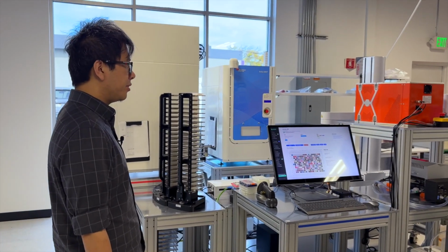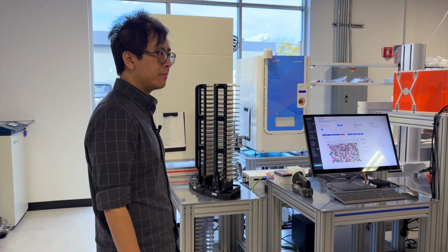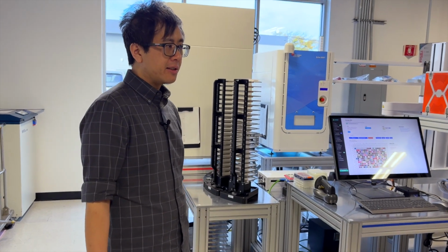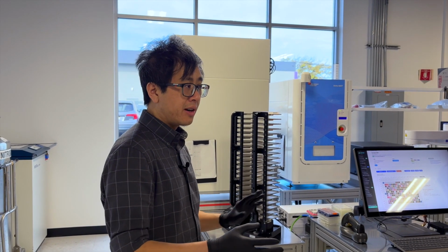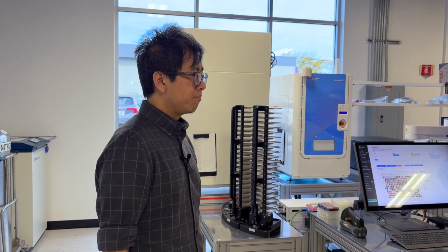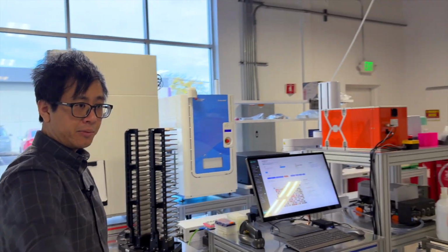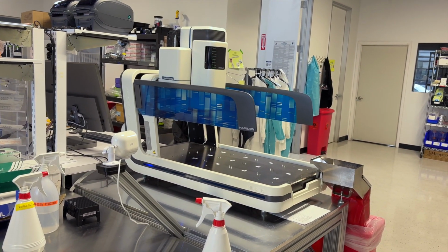Do you have any favorite instruments? I'll give two answers, and they're not really focused around a particular vendor. But for us, I mentioned this one instrument, the Echo, which is the nanoliter dispense machine, and it's particularly helpful if you're doing something like what we're doing, a lot of different drugging of cells in a randomized format, and we want to use a bunch of small volumes. Depending on your use, you could work just as well with something like that machine, which is essentially an automated pipetter, which would work anywhere from the microliter to milliliter stage.